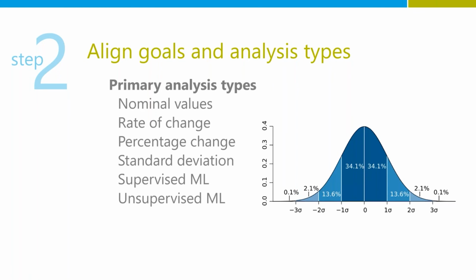So you'd look at a linear regression of that data, and you would say maybe 3 parts per million is in a warning state, but then you get to potentially 6 parts per million and something's bad. So they're just kind of thresholds or rungs on the ladder, depending on where you're at, to determine the classification of the data. Rate of change gets a little more complex, and this is where you're looking at not just the individual data point, but maybe some previous data points behind it to determine, are you in an exponential curve of increasing or decreasing value of the data, or is it just a linear path, and that's okay because that's what's expected.